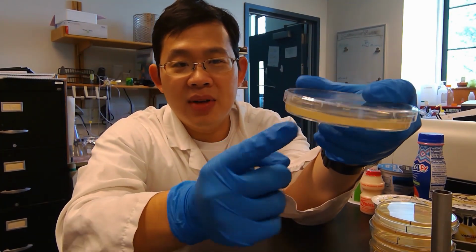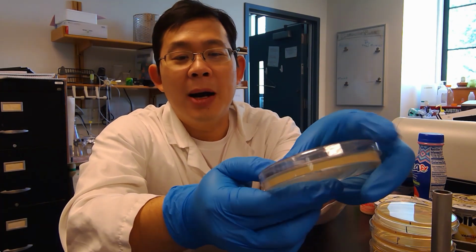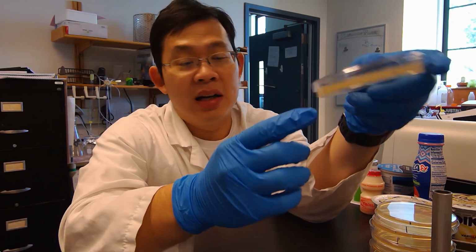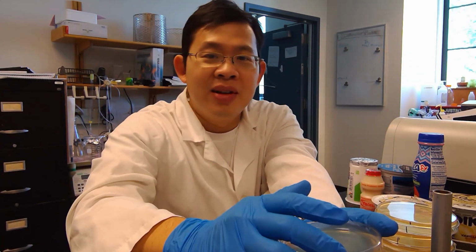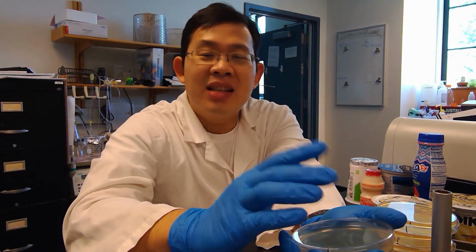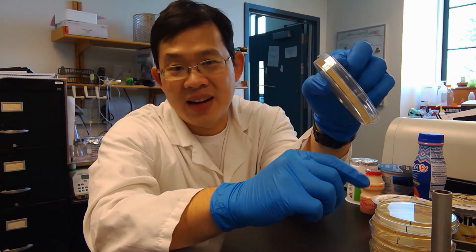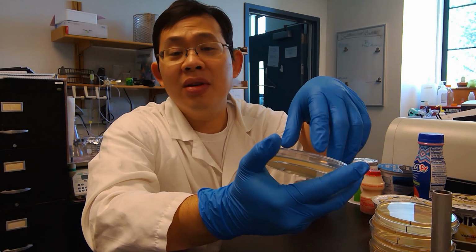So here's again, this is the agar plate. You have the bottom that has the agar, and you have the lid right there, right? And when you label your plate, it is always best to label it at the bottom, because if somebody comes into the lab and switches around the lid, which hopefully is not happening, but if such a thing happens, then at least your label stays with the agar where your organism will be found. If you label on the lid and it is put somewhere else, then you're screwed, right?